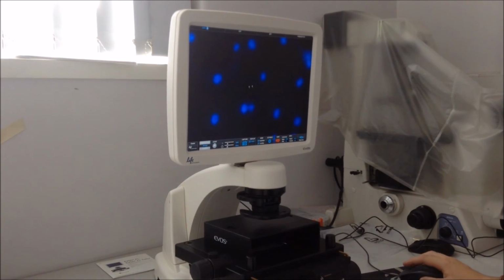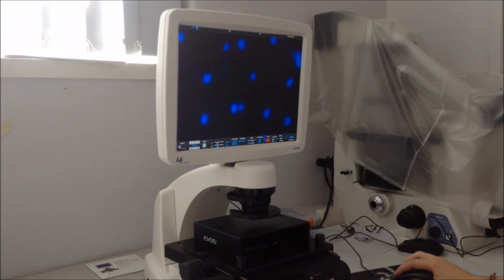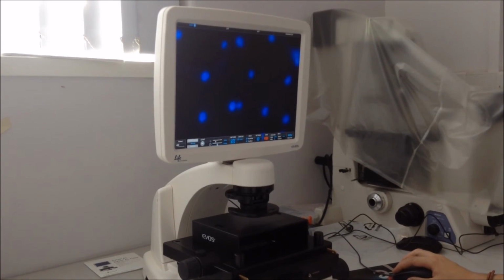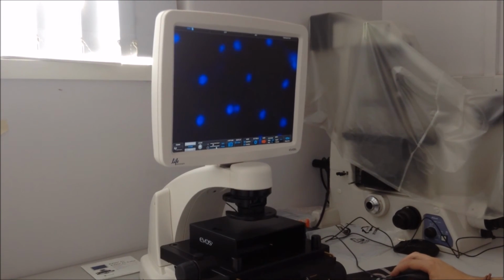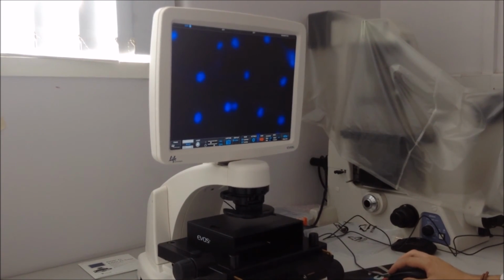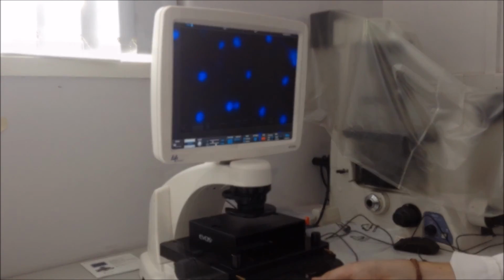Another useful feature is the ability to increase the exposure time. By increasing the exposure time, you'll be exposing the cells to more light, and you can therefore build a clearer image. As a result of this, the time taken for the image to load up will be considerably longer, as a result of greater clarity.